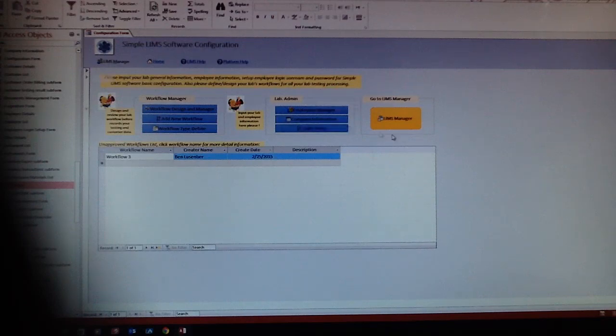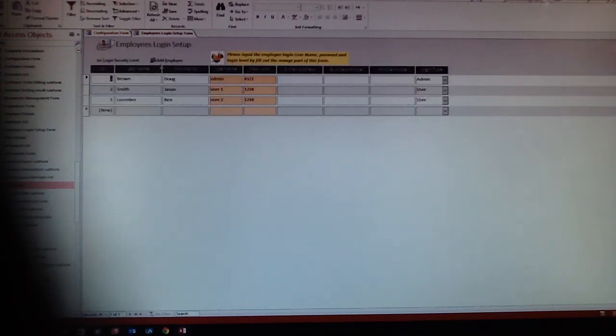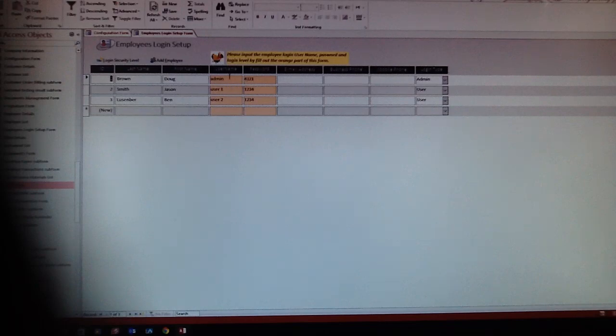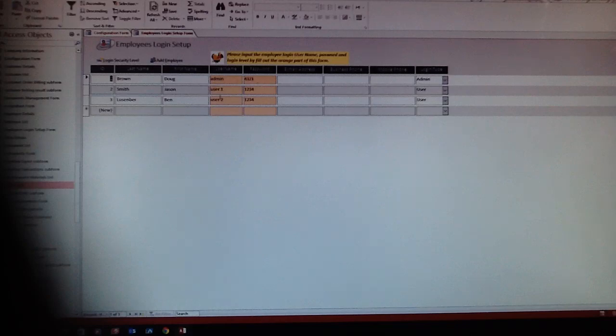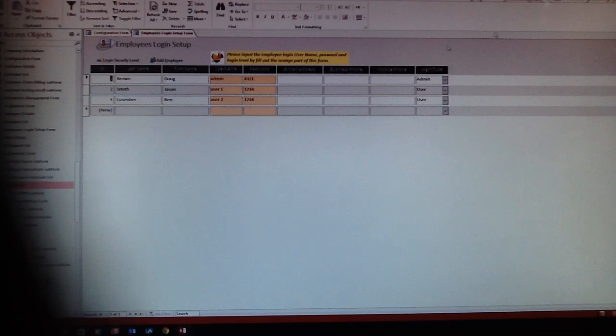Here is the login setup. You have three in place here with user names, passwords, and security levels. You can always change it. We have default elements and user 1 and user 2, but you can always change it.